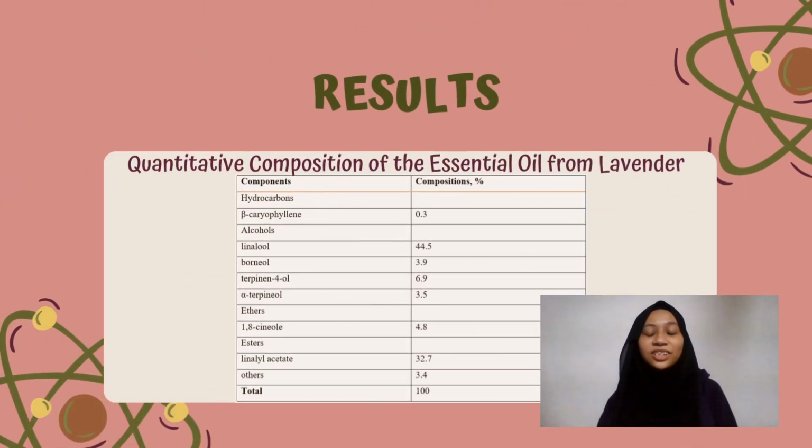Hi, my name is Anis Irina Binti Aziz, and I'll be talking about the result and discussion for this experiment. For the result, the table shows quantitative composition of the essential oil for the lavender. The composition percentage from all the components are as follows.